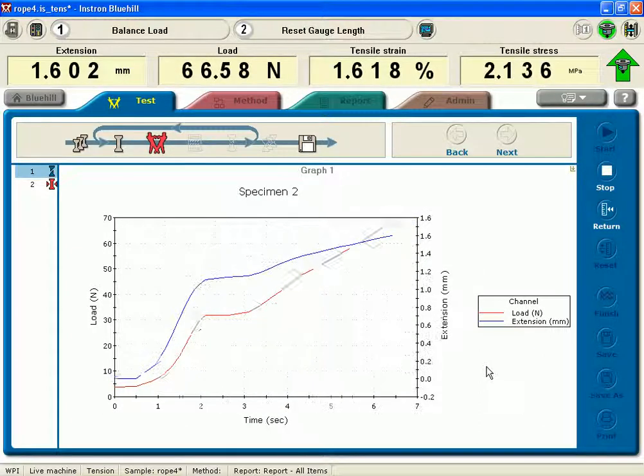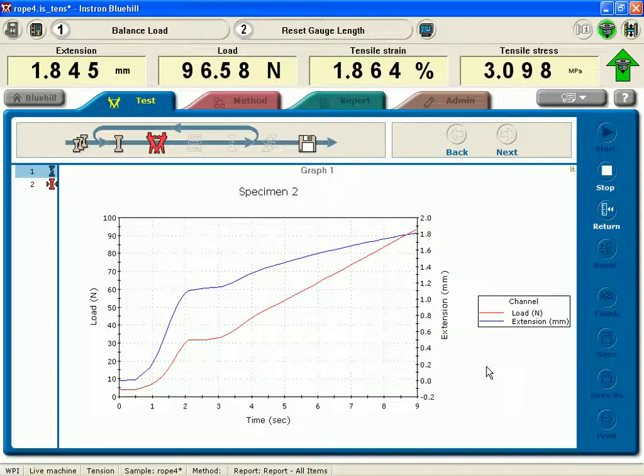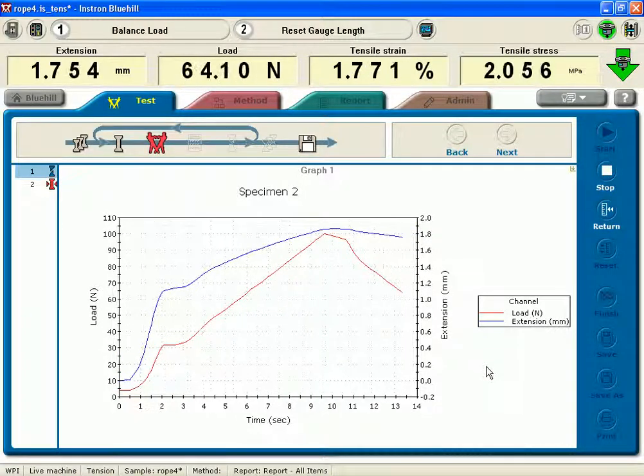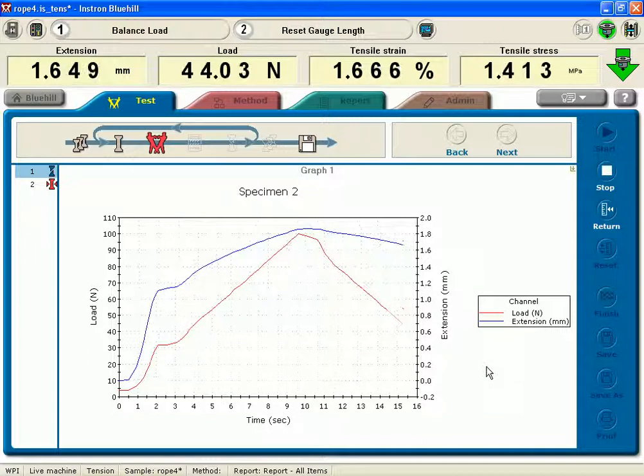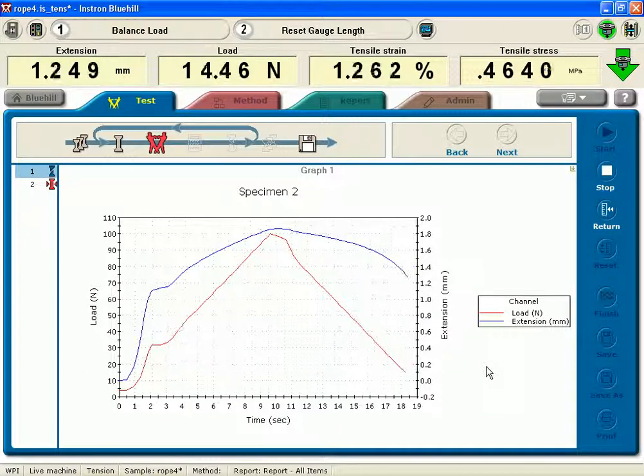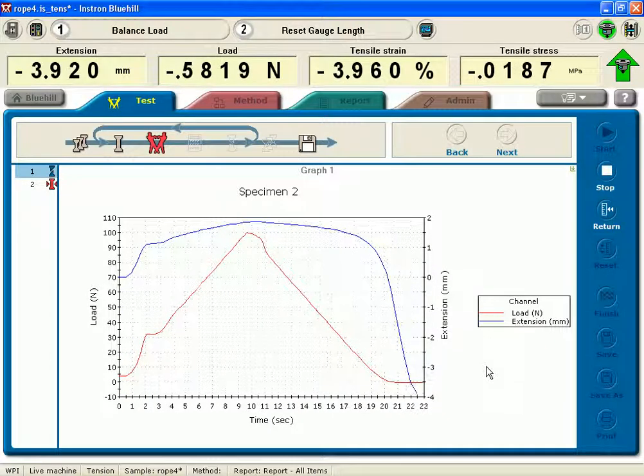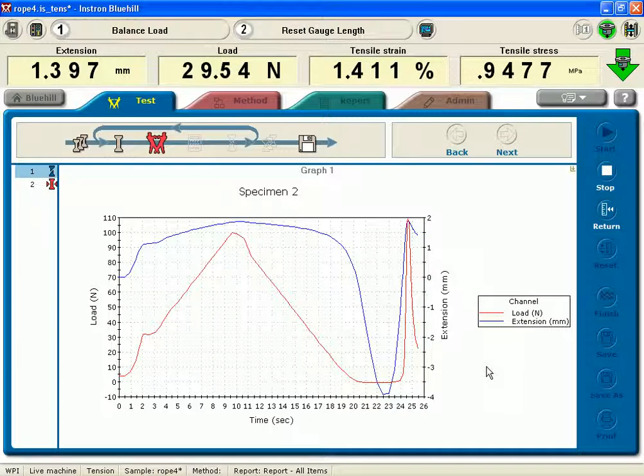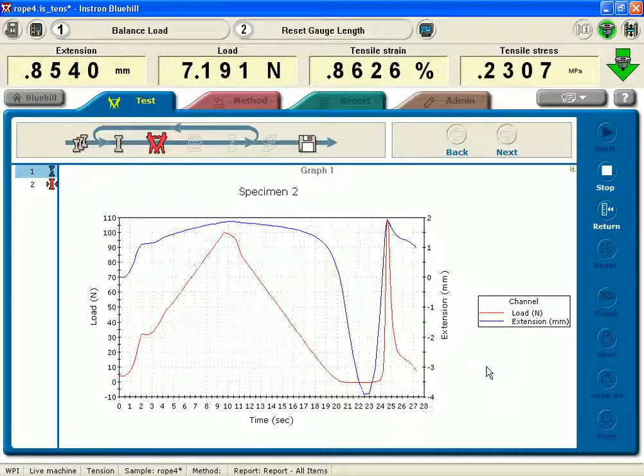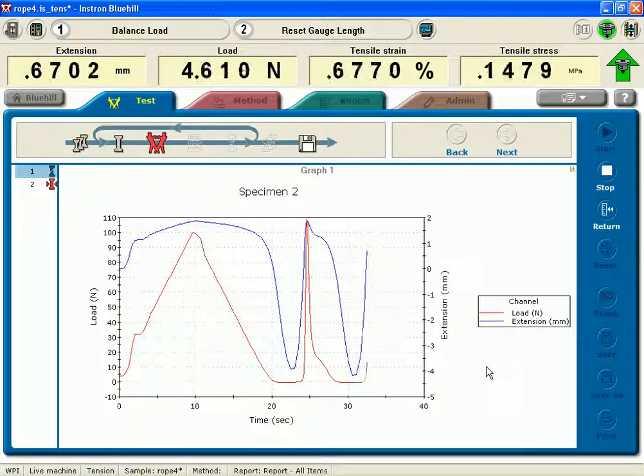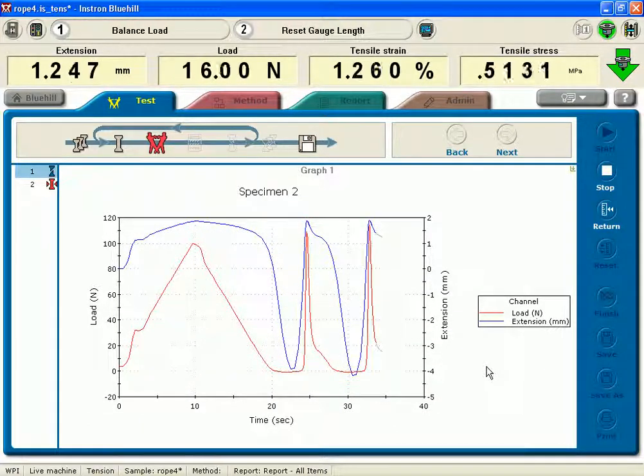As you notice, the load displacement behavior is fairly non-uniform. It's supposed to be ramping directly up at 600 newtons per minute, but there's some give in the sample and this is not doing very good load control. Now it's stopped at zero and now it's shooting up very quickly at 600 newtons per minute, but instead of stopping at 100 newtons, it overshoots to 120 newtons. You can see at the top here at 120 newtons.